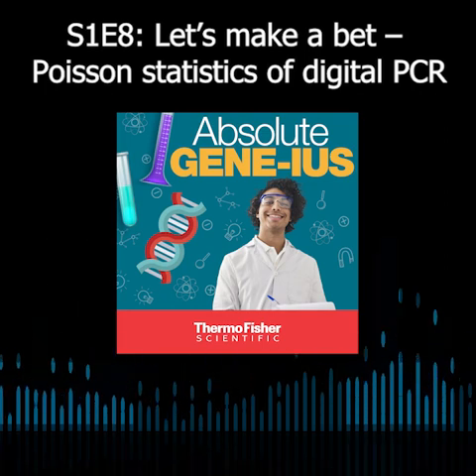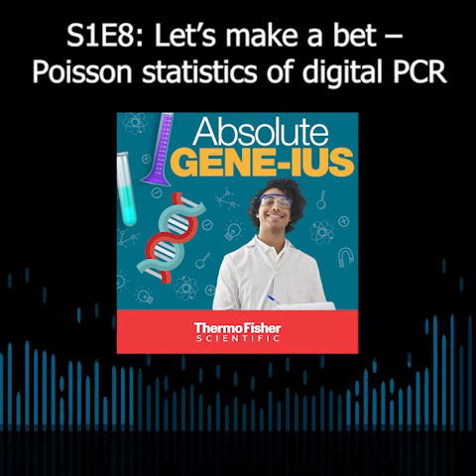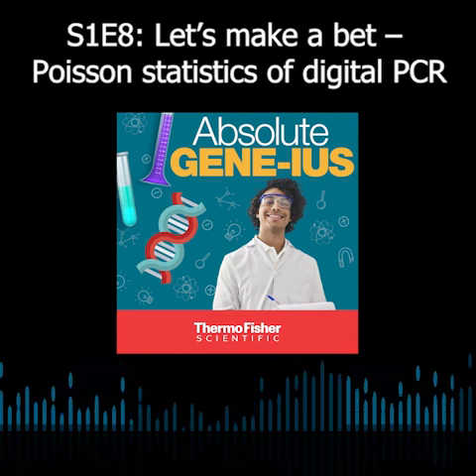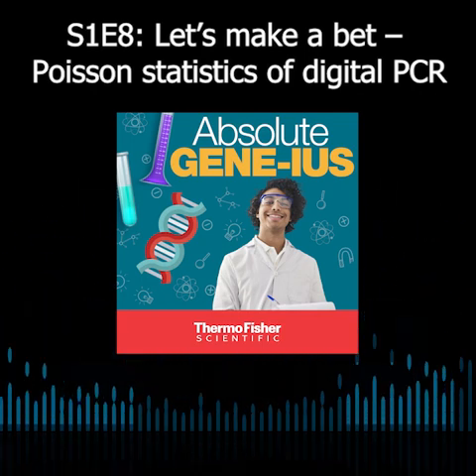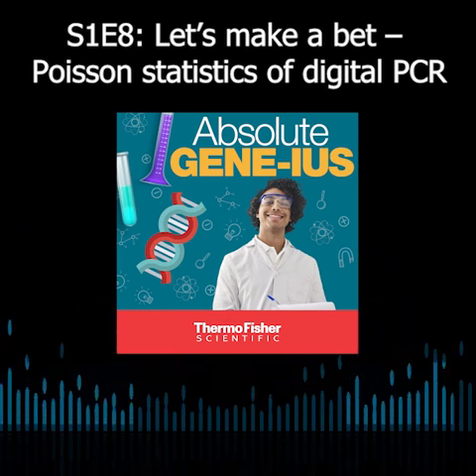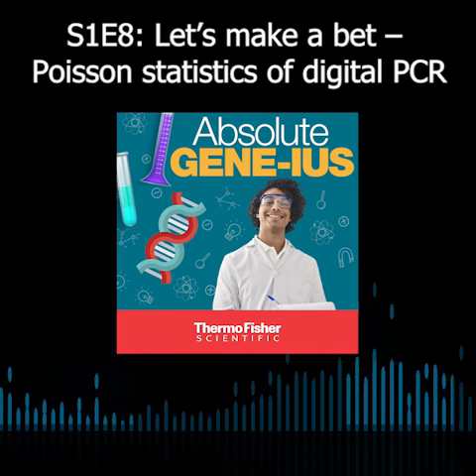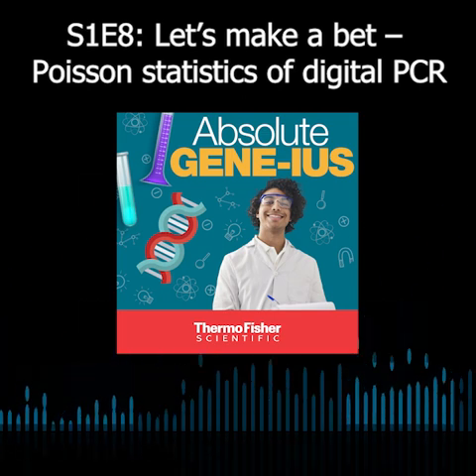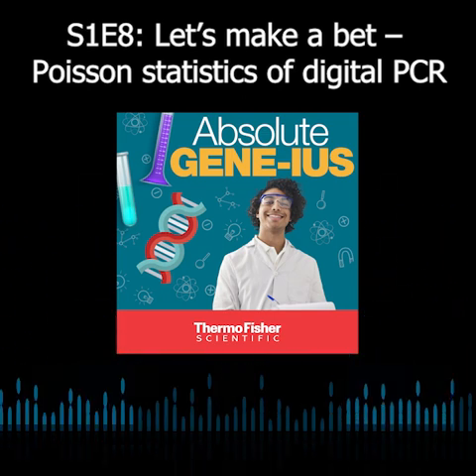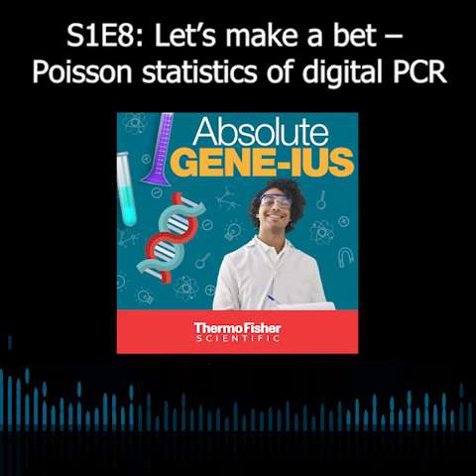So, if on average you had one DNA molecule per chamber. So with 20,000 chambers, let's say I happen to have exactly 20,000 molecules. There's then a distribution expected of this fraction of the chambers will be empty, this fraction will have 1, will have 2, 3, and so on. But like we said before, we can't tell the difference between 1, 2, or 3 molecules.